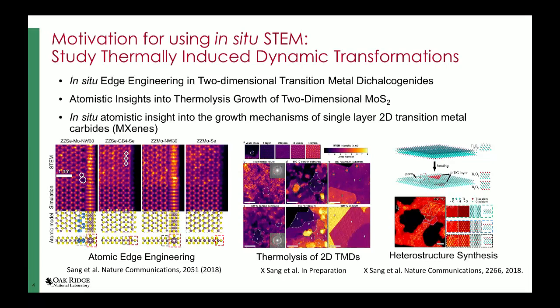We can use this to gain insight into thermolysis, which is the breakdown of molecular species to form new structures, and also use in situ microscopy to study the synthesis of new heterostructures, all at atomic resolution and all as a function of thermal exposure.